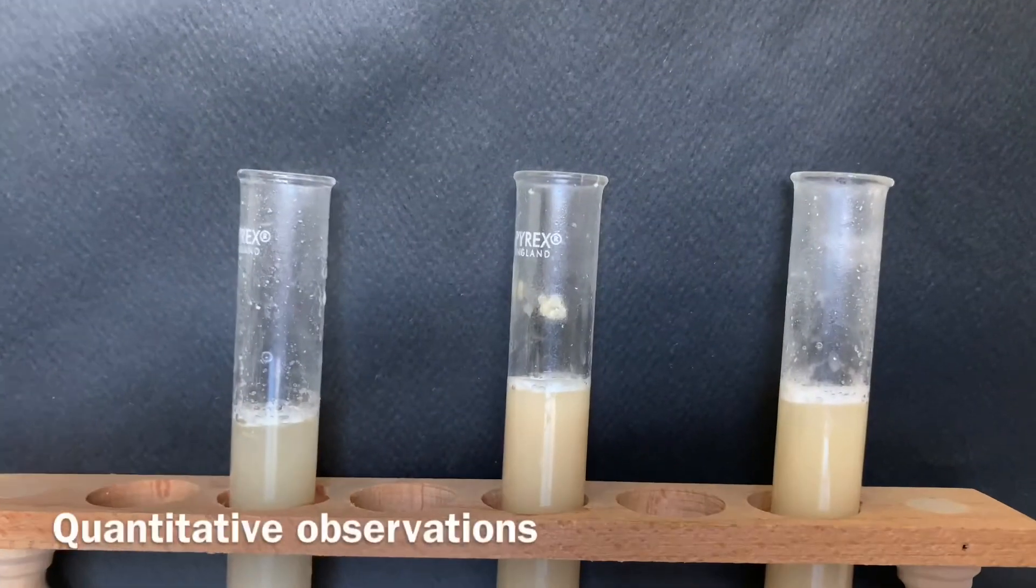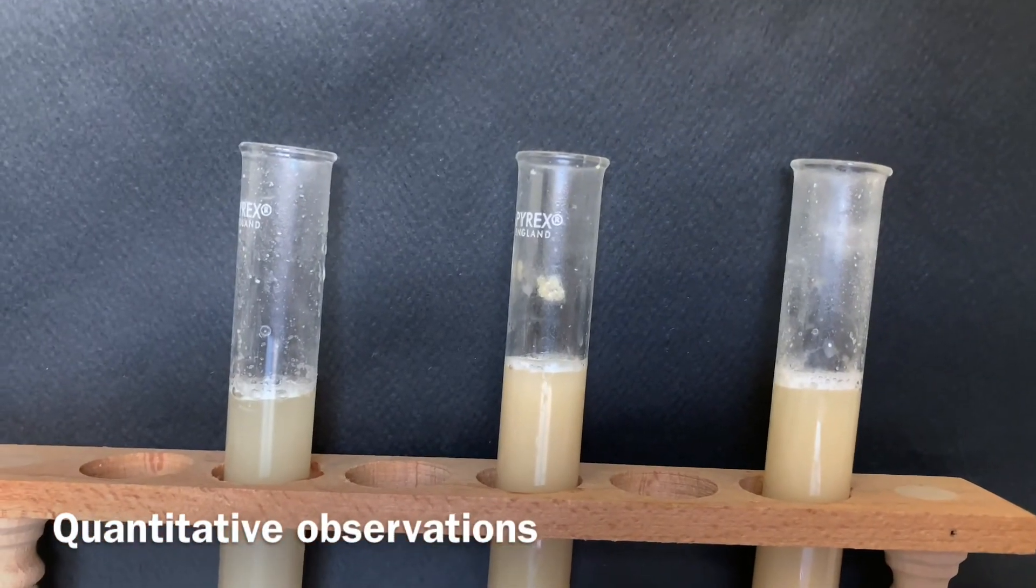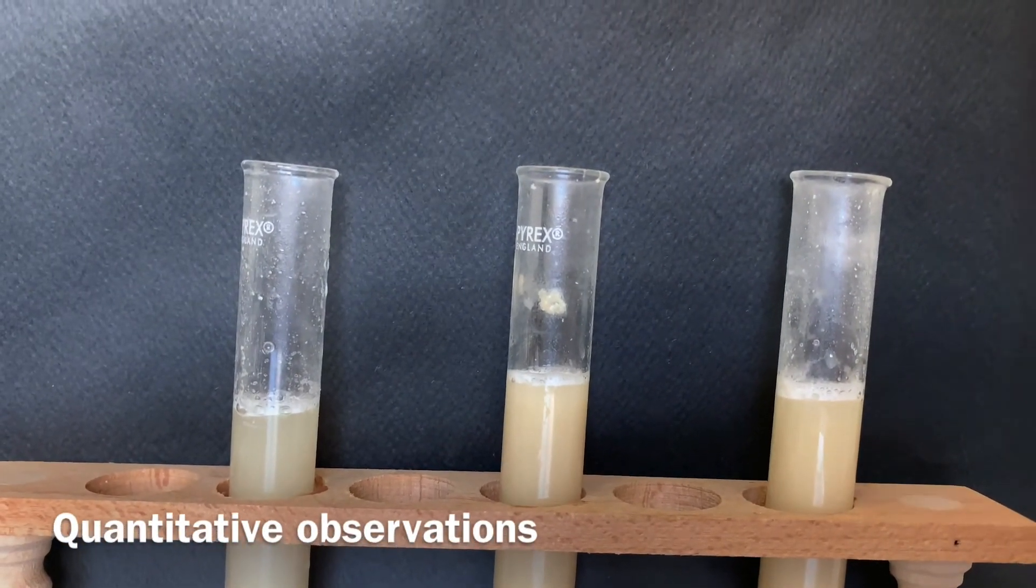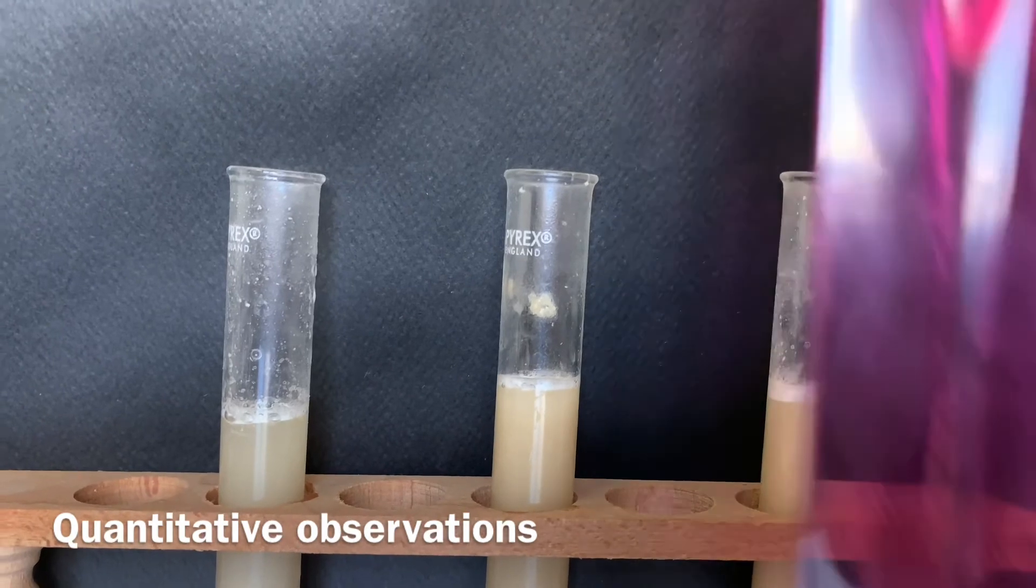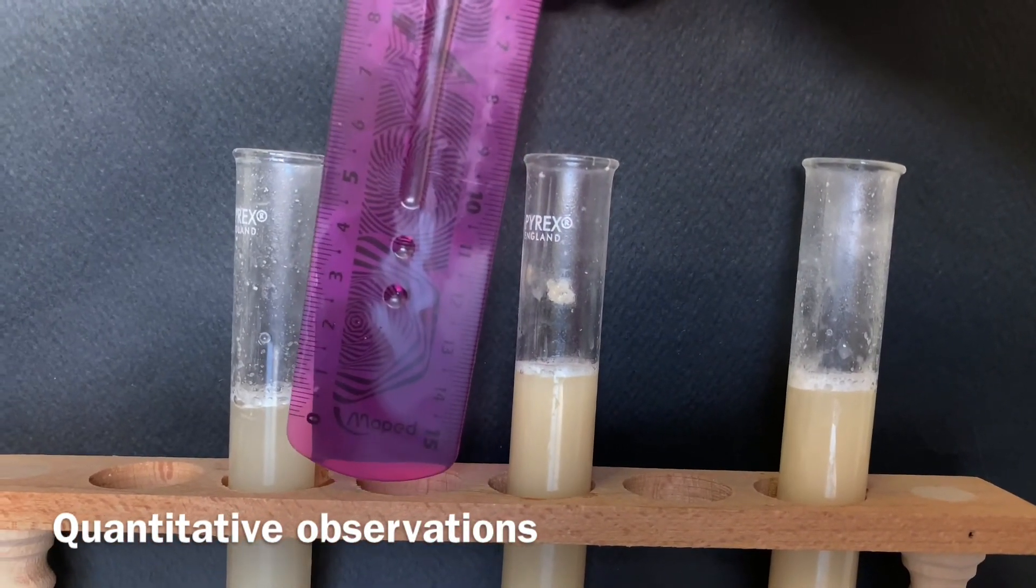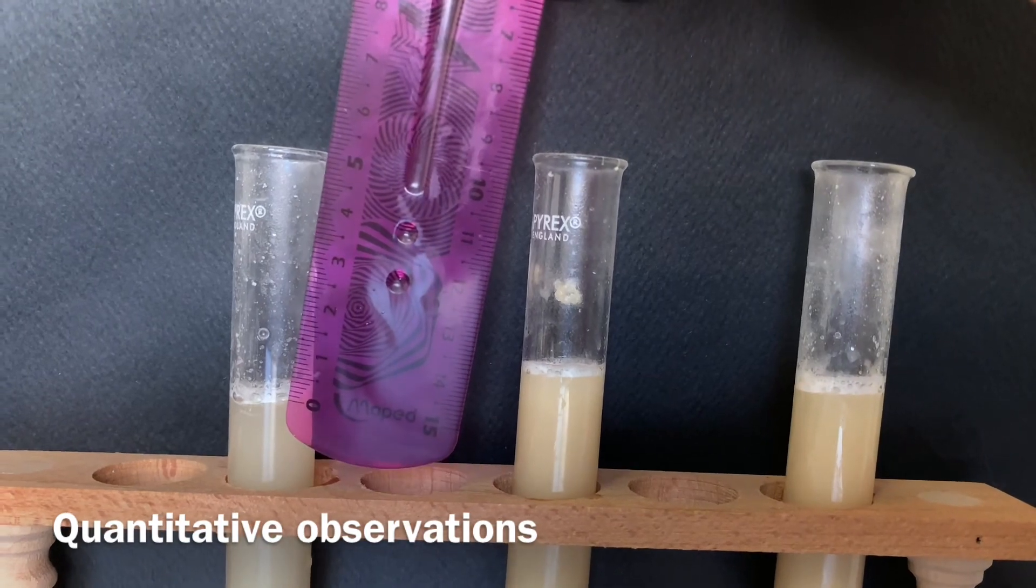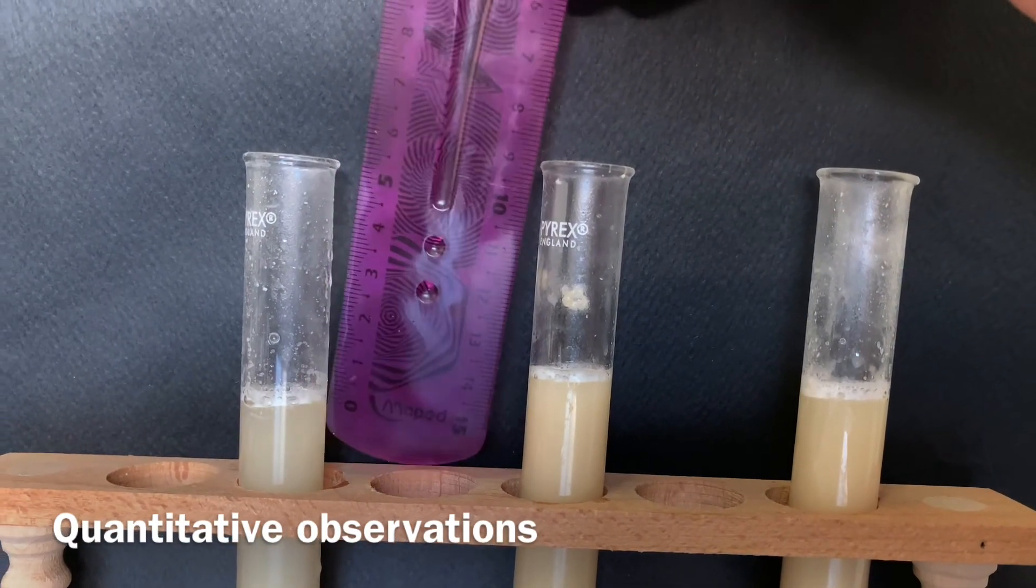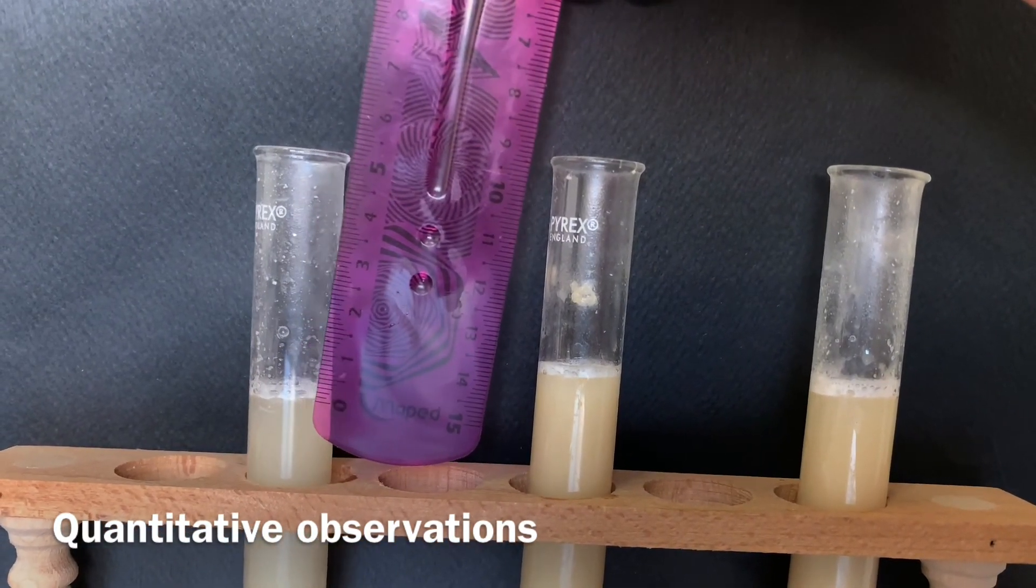In addition to collecting qualitative observations, I'm also going to be collecting quantitative observations by measuring the depth of the bubbles that were produced in each test tube. In the first test tube, there is around 0.2 centimeters of bubbles produced.